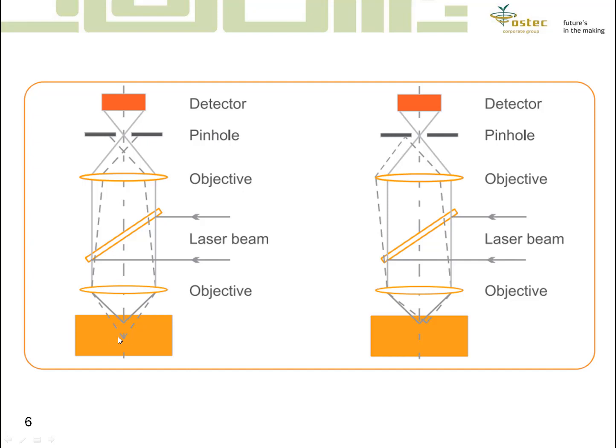If some signal comes from inside the material, then when it goes to the confocal pinhole, it is not focused inside the pinhole, it is a defocused spot, and so it does not affect the detected signal much. This is how we can separate signals from different Z positions.